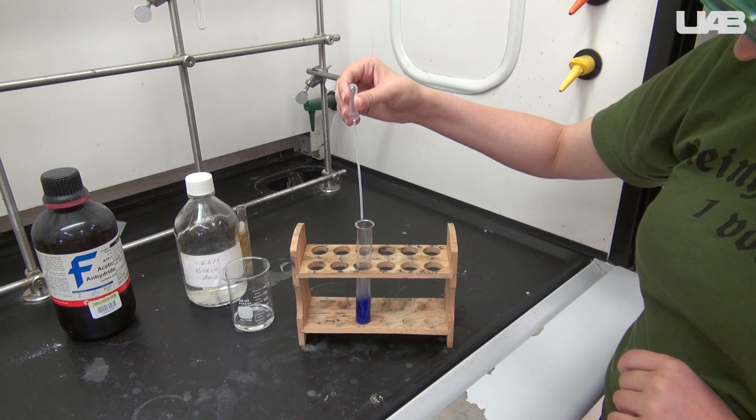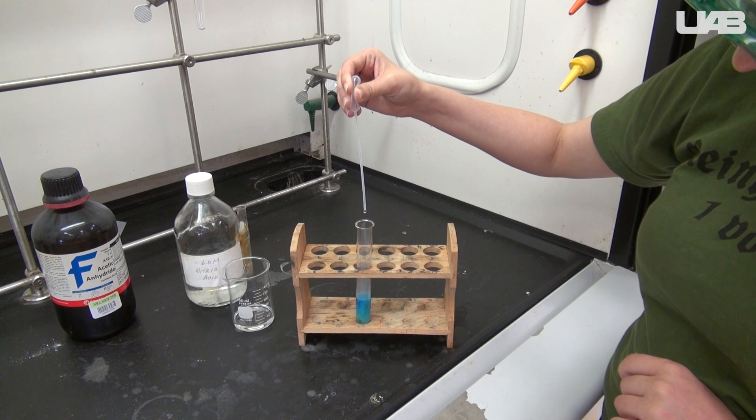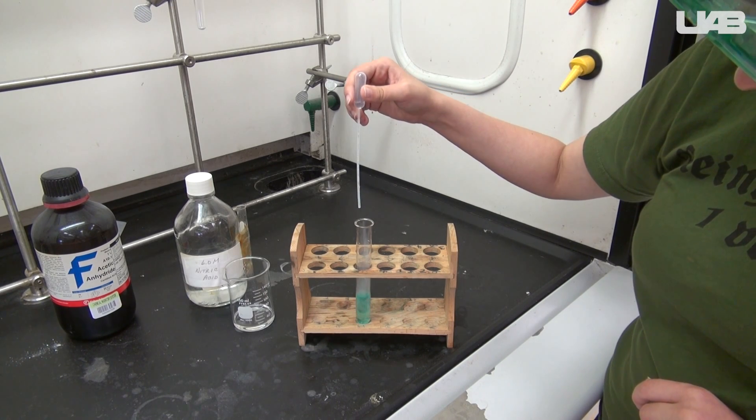Next, you will add 6 molar nitric acid until the solution returns to how it looked before. Record your observations. What is the predominant species here?